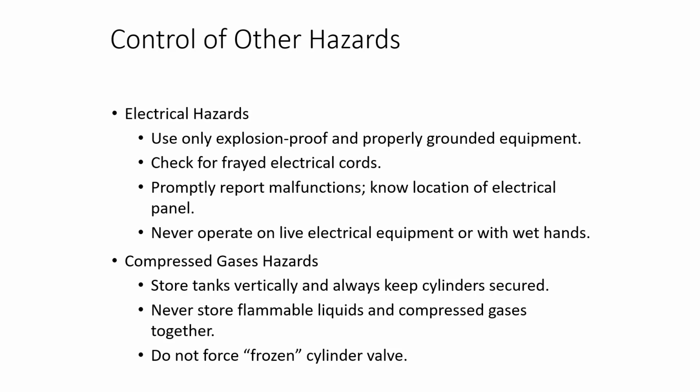Compressed gas hazards: store tanks vertically and always keep the cylinders secured. The securing of cylinders is a law. It's required by OSHA. It's federally regulated. There are specific anchors that will anchor the cylinder to either a desktop or a wall. Never store flammable liquids and compressed gases together. Do not force a frozen cylinder valve.